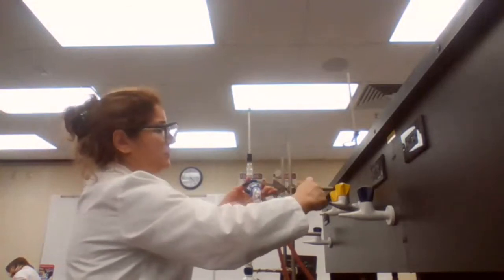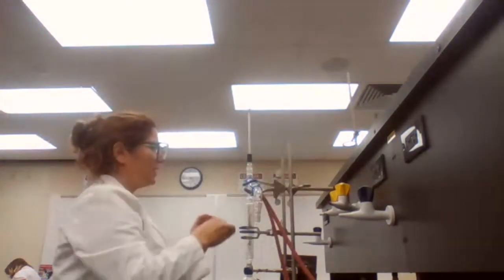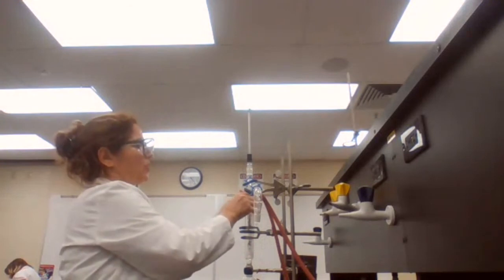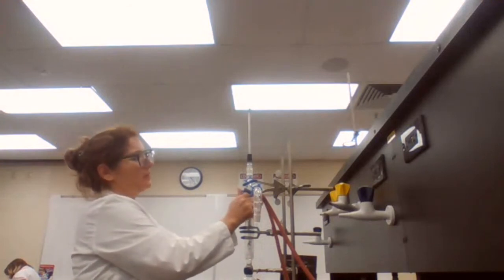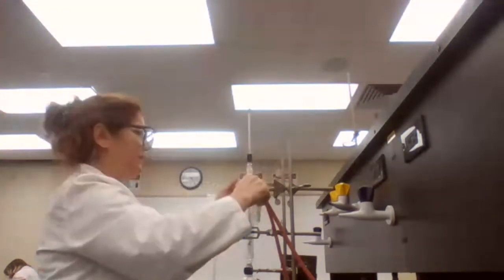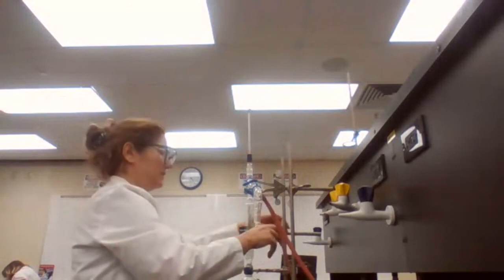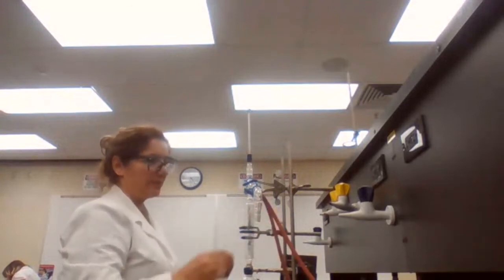Don't make everything too tight at first, because it's glass and it can break if you make it too tight. Make it finger tight, loosely, just to secure it. And when you level off everything, then you can go back and make sure that everything is tight and secure.